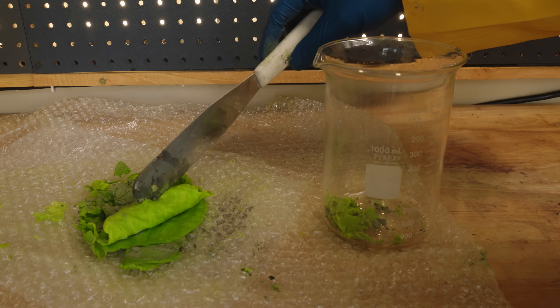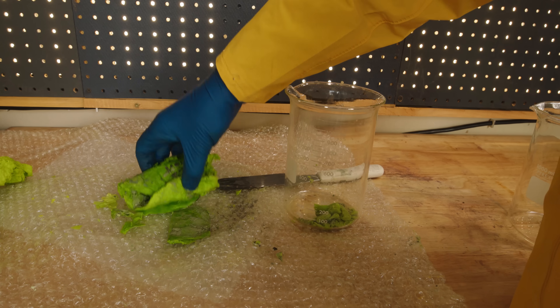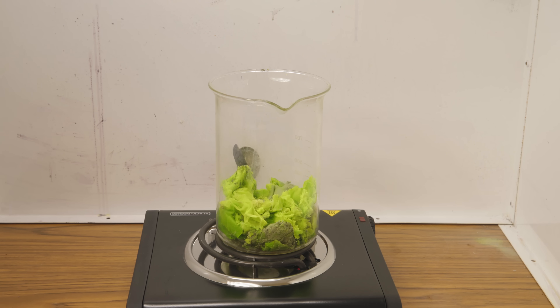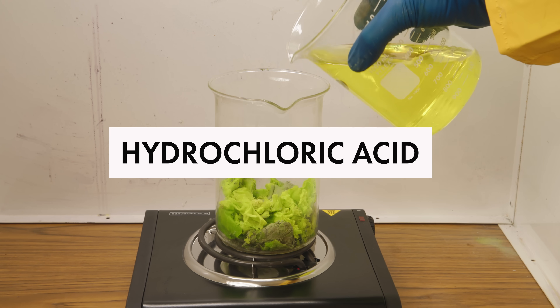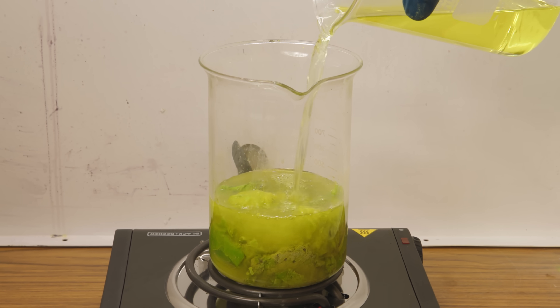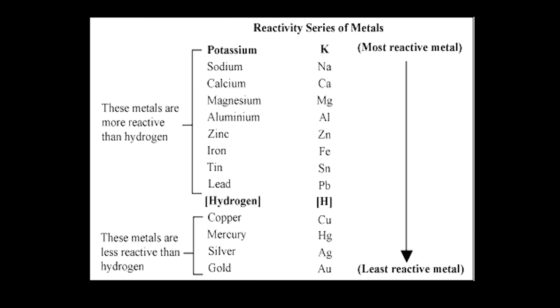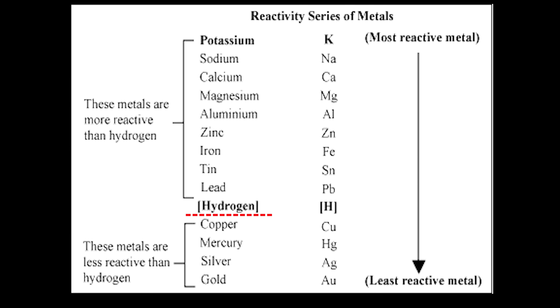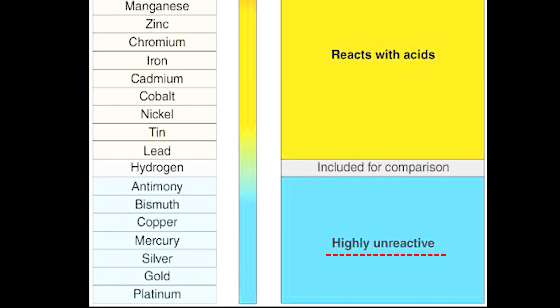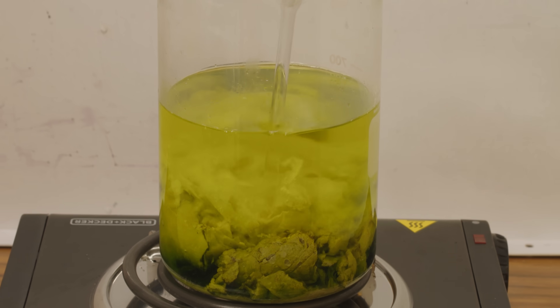I quickly see that it's going to be nearly impossible to separate the paper from the silver chloride, so my best path forward is to drop it all into the beaker. I kick things off by adding 500 milliliters of hydrochloric acid. I specifically use this acid because it won't react with silver, but it will help break down the paper. By taking a look at the reactivity series for metals, we see that hydrogen is more reactive than silver, meaning that adding hydrochloric acid to silver will produce little to zero reaction. I let everything soak for an hour, then mixing with a stir rod, the paper easily disintegrates.